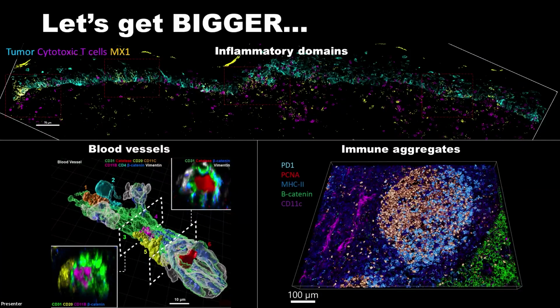So what's next on the horizon for 3D imaging, and how often do we need it? Right now, no one is suggesting that 3D will fully replace 2D imaging. 3D is still quite expensive and requires more patience to set up and maintain, although I know that LifeCanvas and other companies are working to change that.